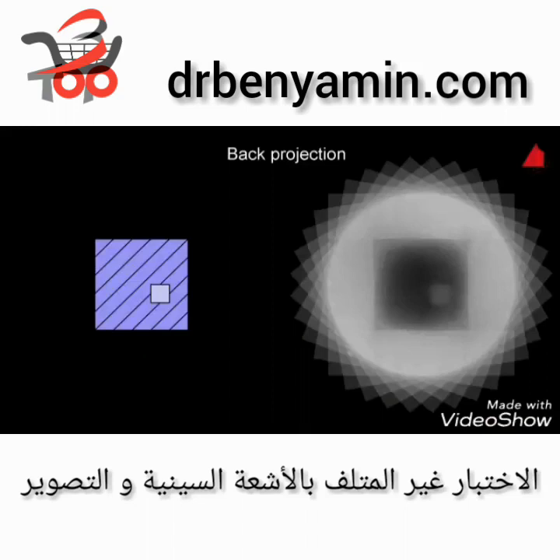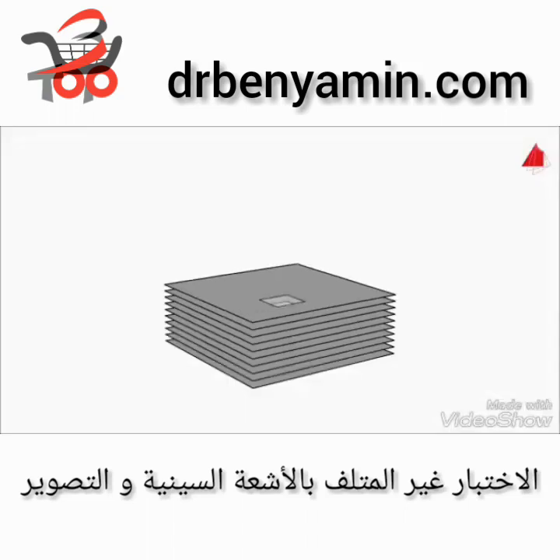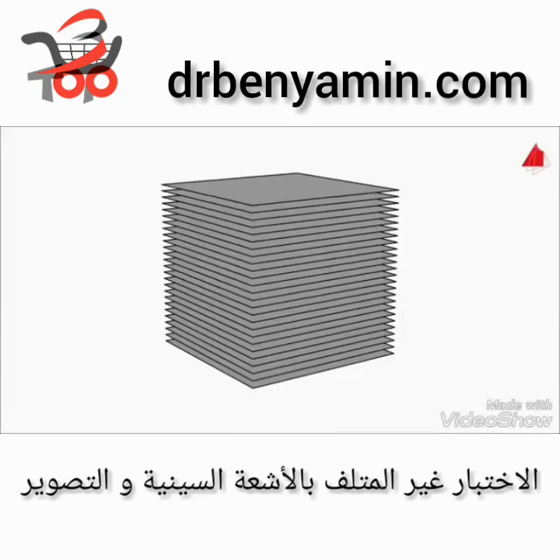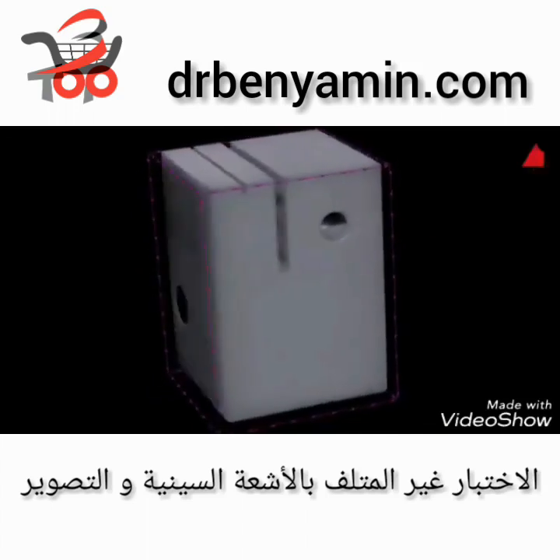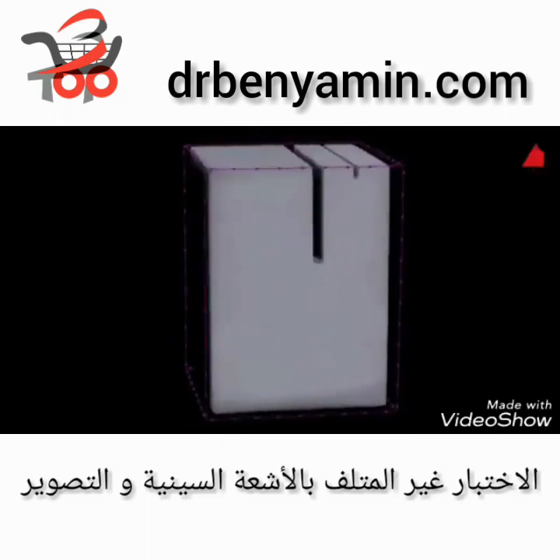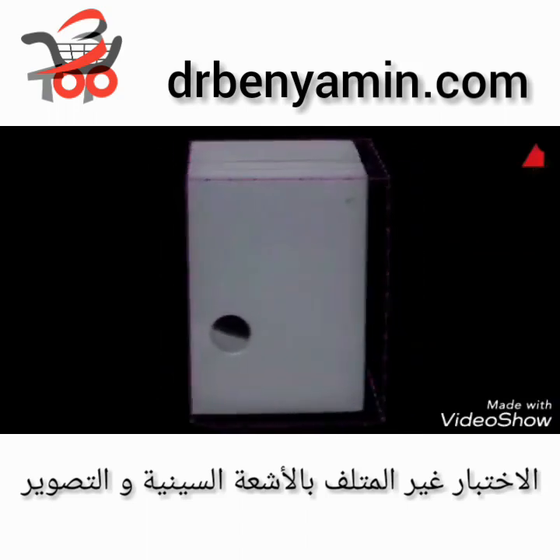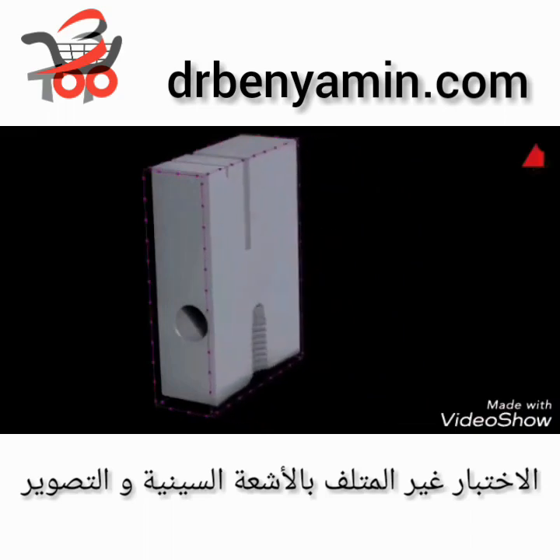The back projection is carried out successively for each sectional plane, until finally a three-dimensional model of the sample is generated by the computer. Using sophisticated visualization methods, the sample can be examined in detail on the computer display. This is the computer model of our aluminium sample. Not only can it be viewed from the outside, a look at the inside is also possible by means of various sections through the specimen.